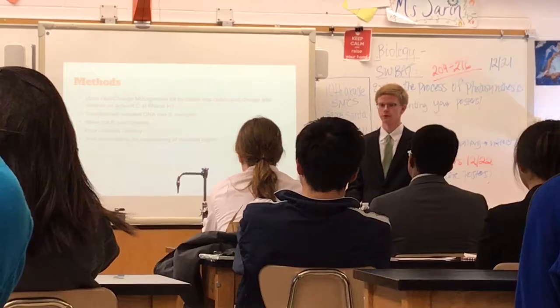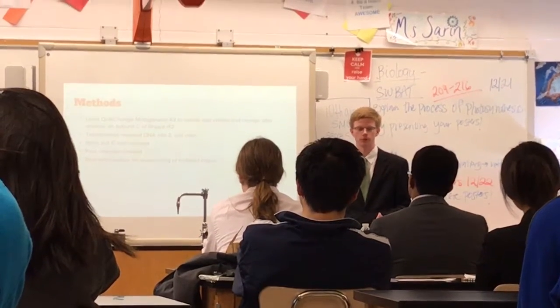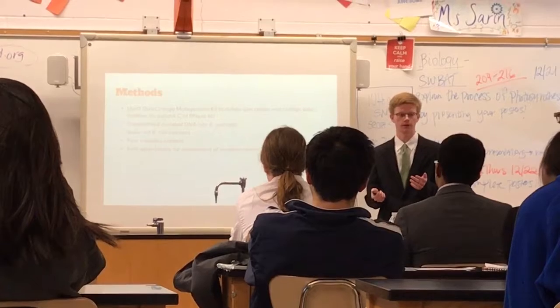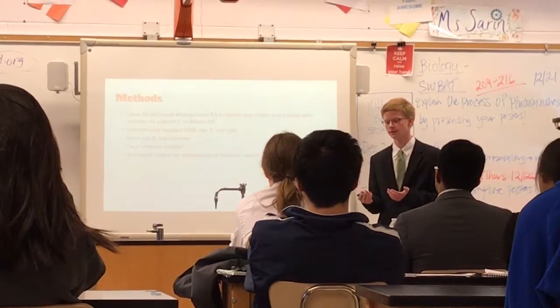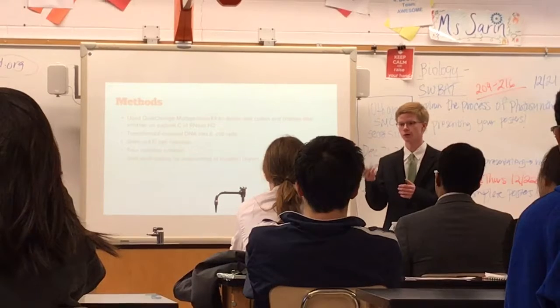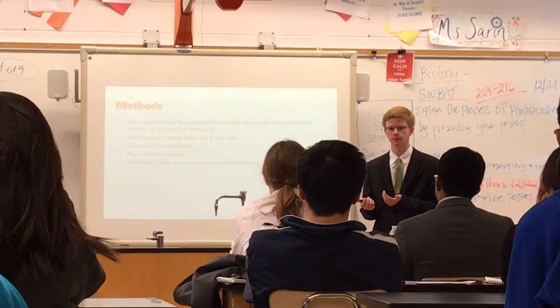And afterwards, I transformed this DNA into E. coli cells. Now you might ask, why E. coli cells when this is a yeast protein? Well, in the lab, you use E. coli for many different things, but one of the common uses is to store proteins like this. With a template DNA plasmid, which is just a circular loop of DNA, you can put it in E. coli cells, and they can produce proteins that you want, no matter what organism it's from.